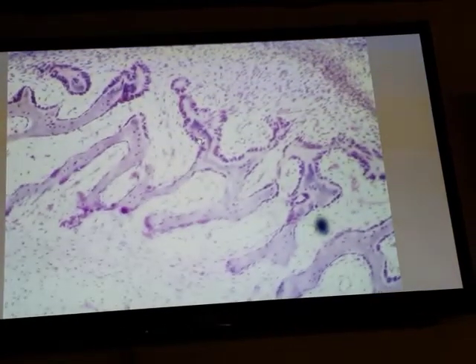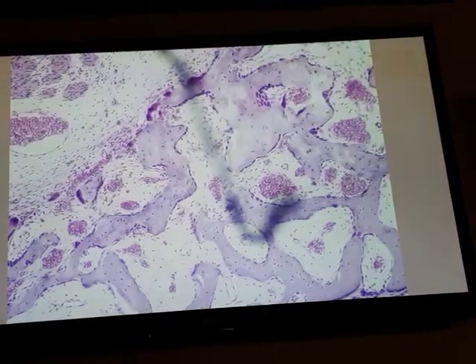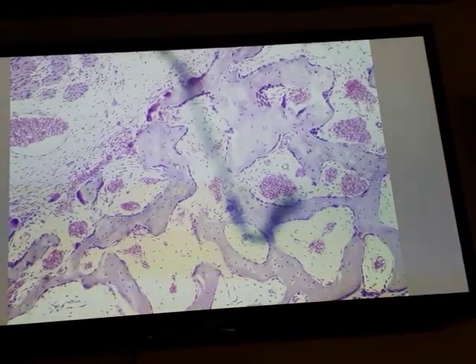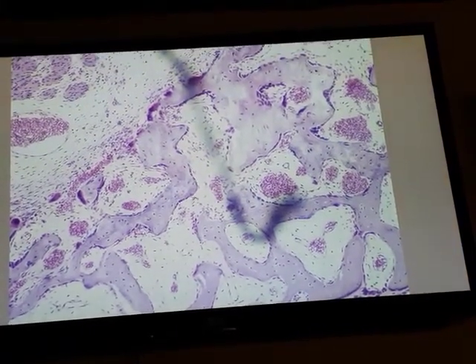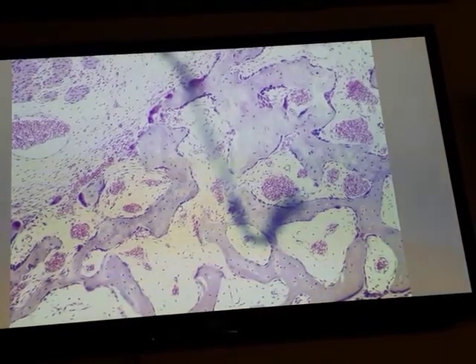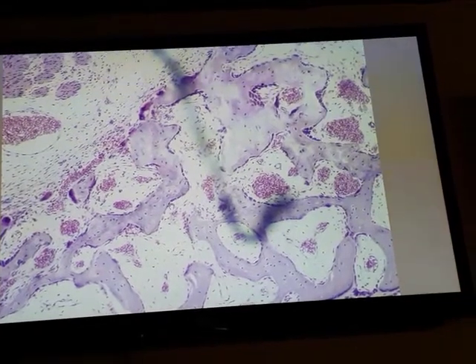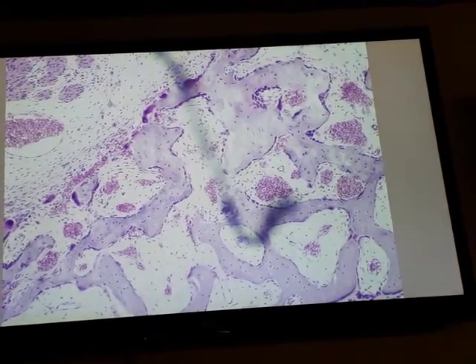This is a section in membranous bone. Intramembranous ossification is responsible for the formation of flat bones and takes place within a condensation of mesenchymal tissue. This is primary bone tissue; it appears as spicules. At the surface, we have osteoblasts. These cells are arranged side-by-side, resembling simple epithelium. When they are active, they appear cuboidal or columnar in shape.